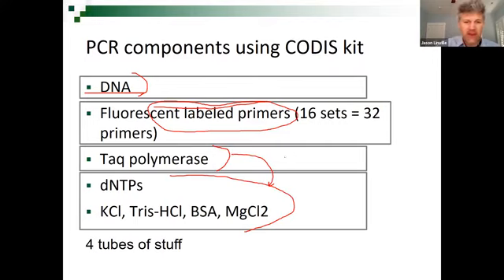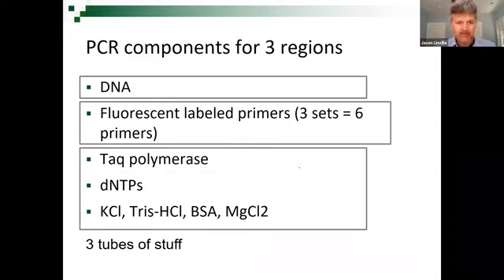But typically the amount of Taq per tube is, I think, like 0.2 microliters or something. And, you know, you use the standard recommended amount of Taq polymerase. But you're getting out a certain amount of tubes, not 1,000 tubes, okay? Putting them in front of you and then just squirt, squirt, squirt, squirt in the tube, close it, and you're done, okay?